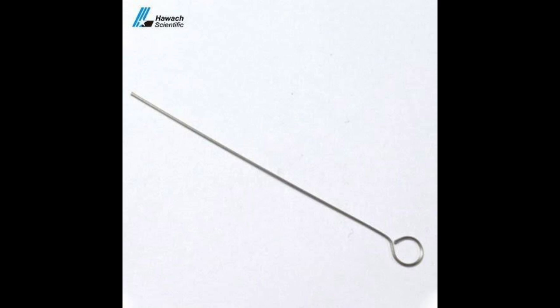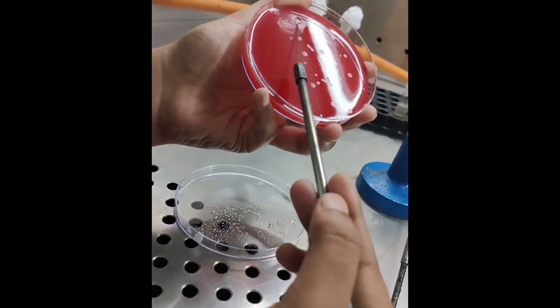In the case of streaking, it is a very different technique, and it is mostly employed to obtain isolates. For streaking, we use an inoculating loop, which is made from platinum, and it has a unique property. When it is heated, it turns hot, and when it cools down, it becomes what it was before, brown colored or blackish, but it will help you identify that the temperature of the inoculating loop is now cool. So now you can use it to inoculate, so that bacteria are not killed if you touch it while it is hot.